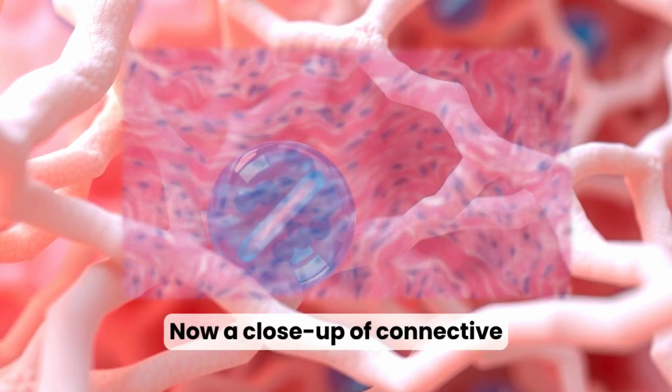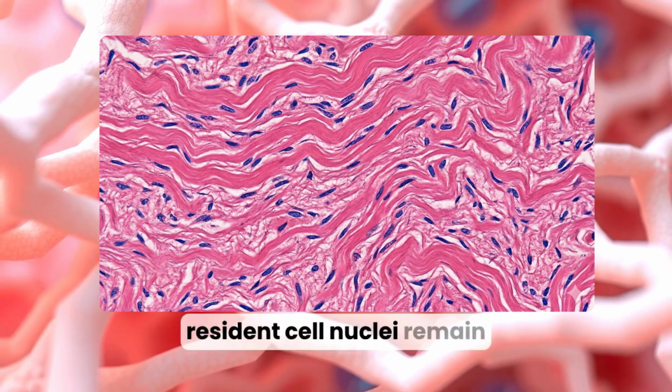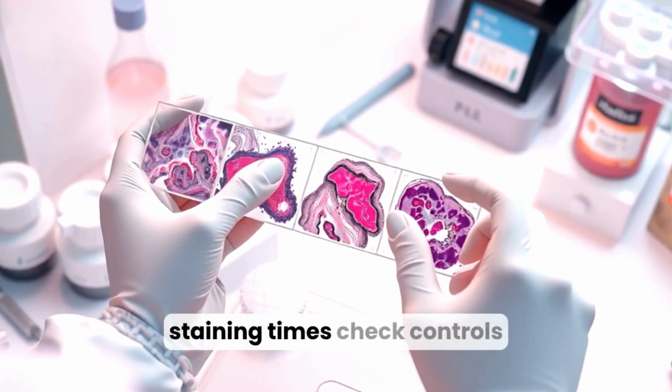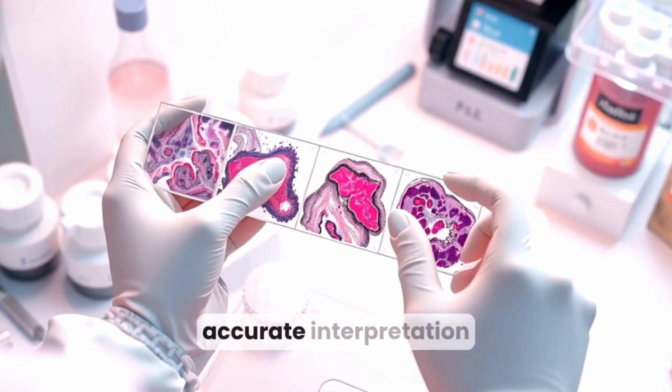Now a close-up of connective tissue. Collagen bundles appear pink and fibrous while resident cell nuclei remain blue and elongated. Quality control tip: ensure consistent fixation and staining times, check controls, and compare slide appearance to known references for accurate interpretation.